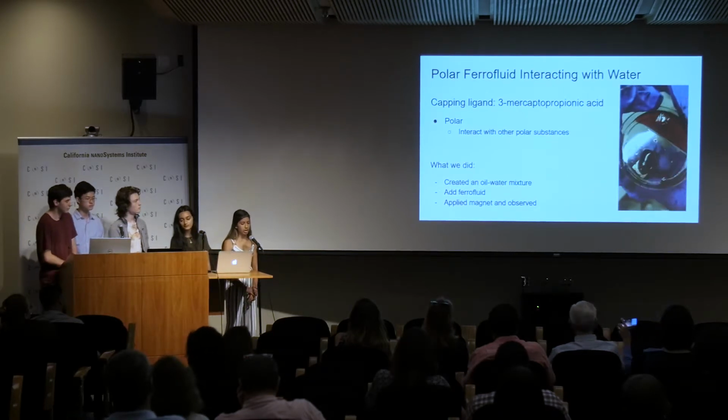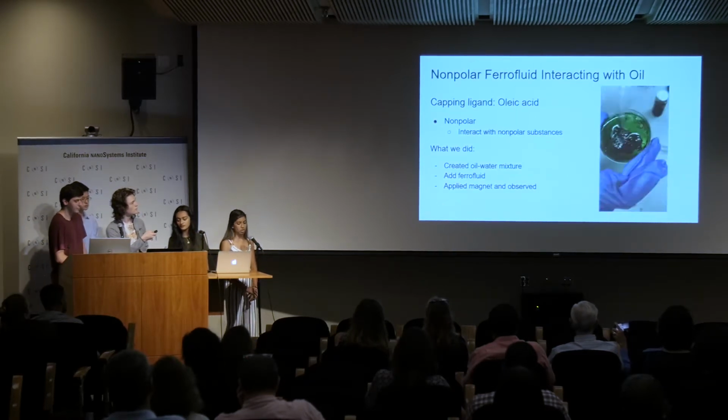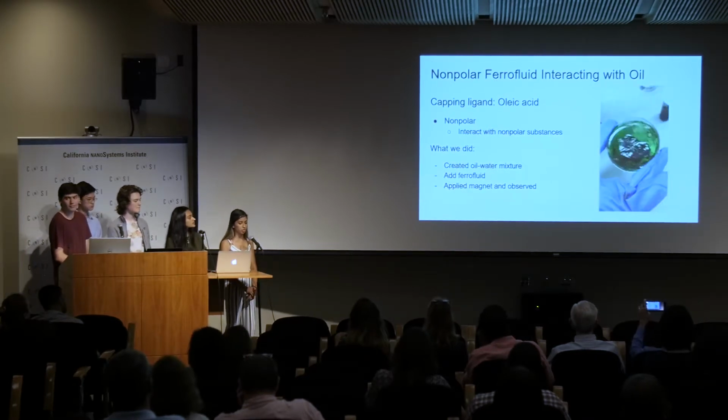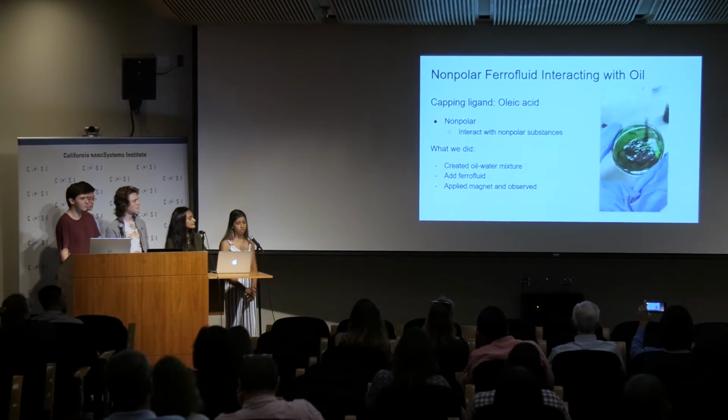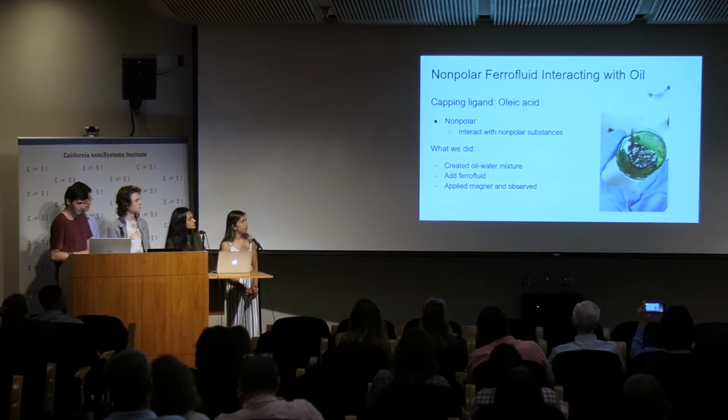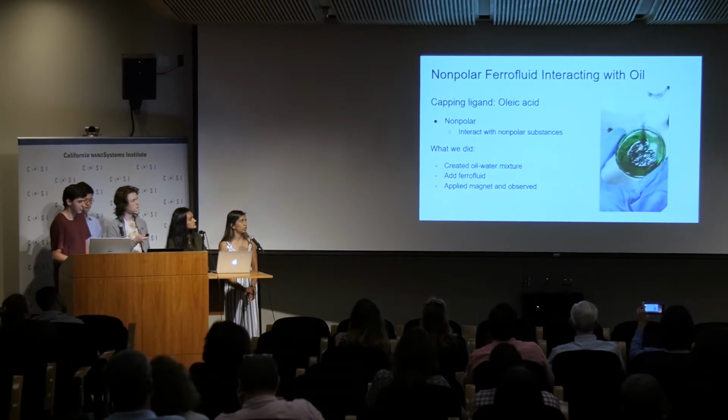So then we used oleic acid as our capping ligand, and this ligand is nonpolar. So we dyed the water green in this test, and when the ferrofluid was added to the oil-water mixture this time, it was clear that the ferrofluid and the oil aggregated towards the center of the petri dish, and the water separated itself around the oil and the ferrofluid.